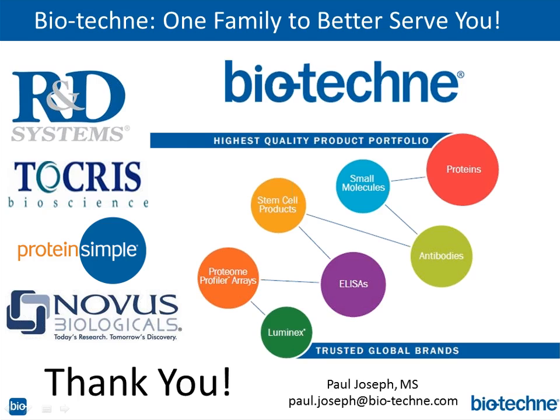Okay. And then Hikaru asks, what's your opinion on using total protein as a loading control instead of a housekeeping gene? Yeah, I think total protein would be fine. I just think it has to be something that's consistent, and do all your checks. Make sure the protein concentration is accurate and your pipetting. But yeah, I just think as long as it's not affected by the experimental condition, and it's not obscuring the protein of interest in terms of molecular weight, it's kind of acting as an independent player. I don't think there should be an issue there as long as it's expressed equally across your lanes to show that you're loading the same and that perhaps your transfer is the same.